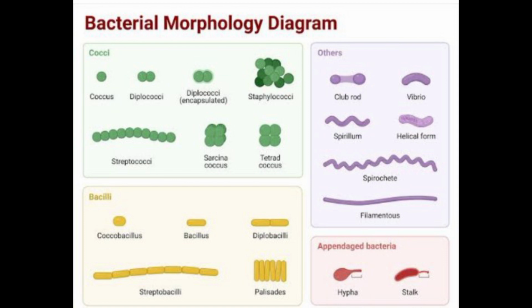Common staining techniques: simple stain. A basic stain such as methylene blue or basic fuchsin is used as a simple stain. It provides color contrast but imparts the same color to all bacteria in the smear. Negative stain.